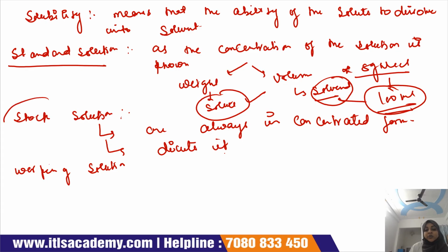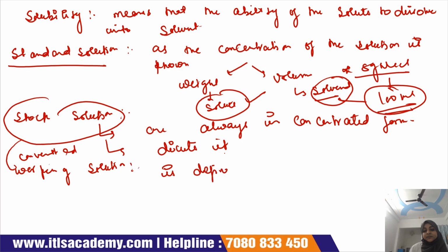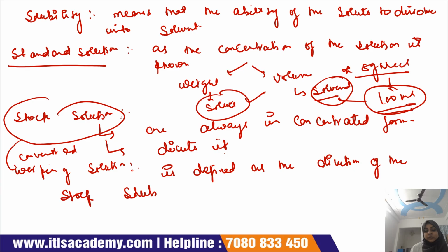Then this stock solution is converted into a working solution. So working solution is defined as the dilution of the stock solution.